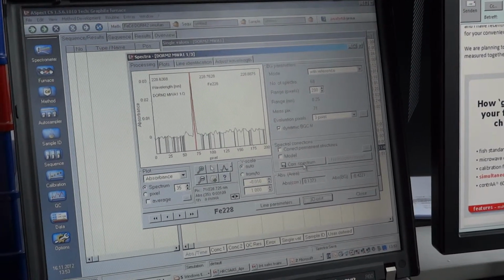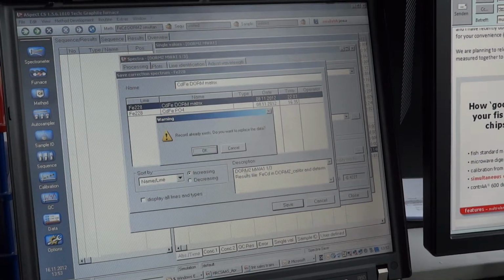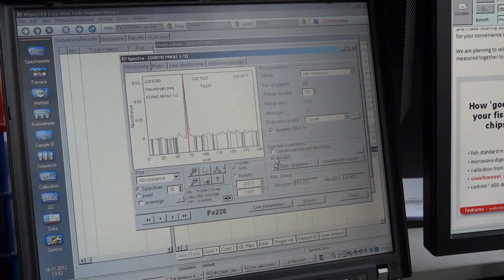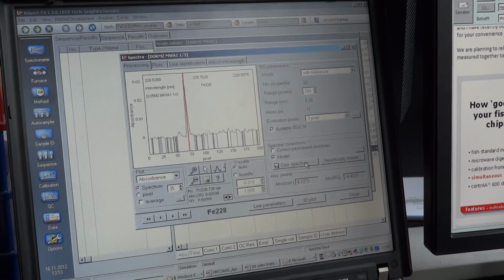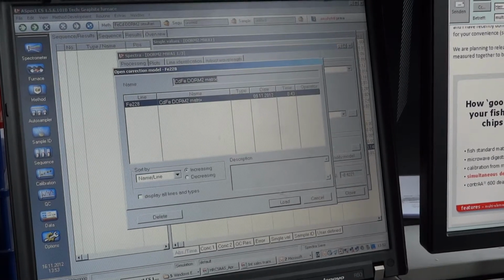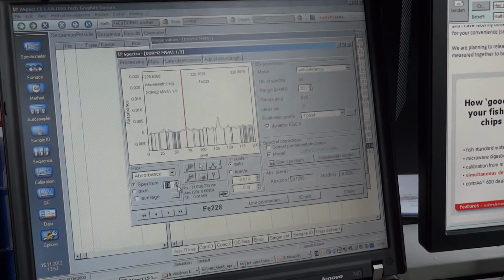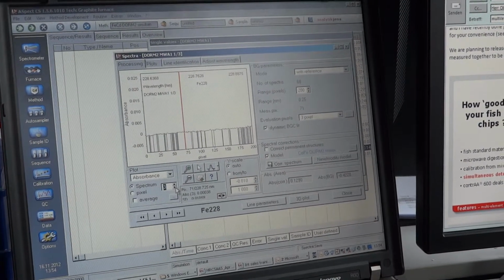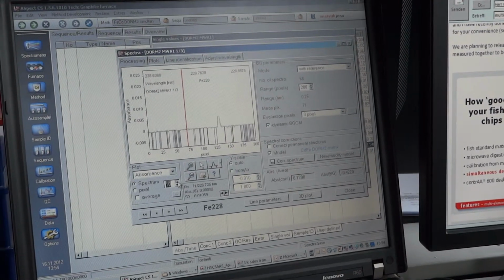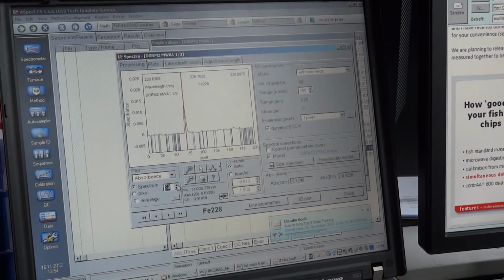Let's say we choose a correction model, correction spectrum. I've already done that, so you just need to load it. Hold on, it's loaded, and then if we look at the spectra again, what we see is that we have managed to suppress the matrix, because if you look at the sequence again, you see the cadmium signal coming up, going down, with little or less matrix, and then the iron comes up.